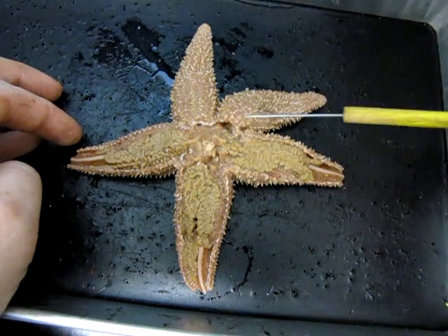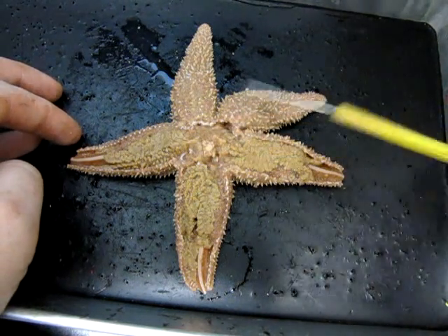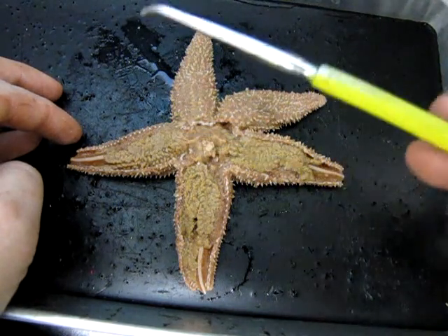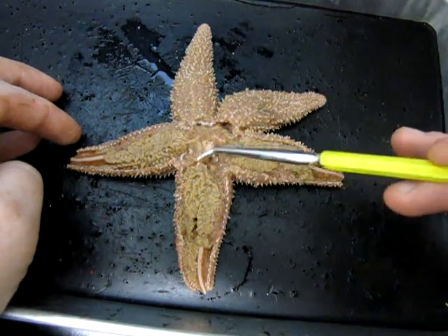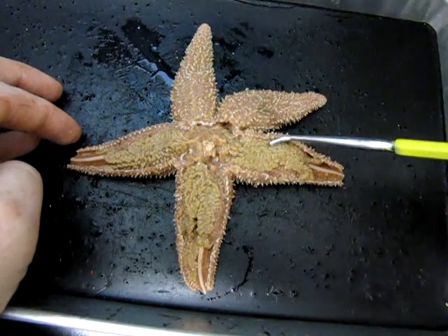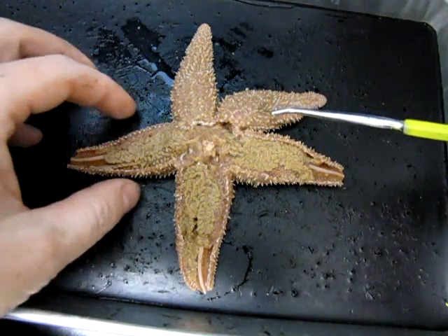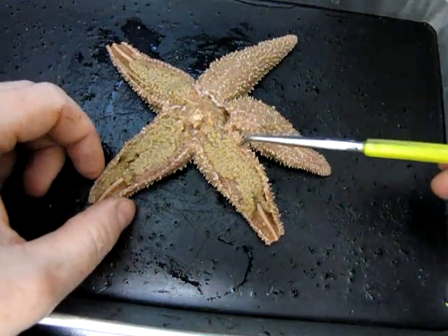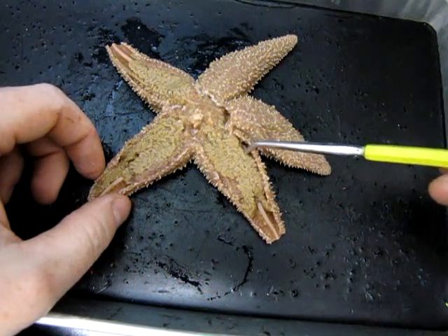The internal structures in each of the arms are identical. The first thing we can see is this rough-looking, spongy brownish mass on top of each one. Those are called pyloric caeca, and they're essentially analogous to the digestive gland that we've seen in other animals.